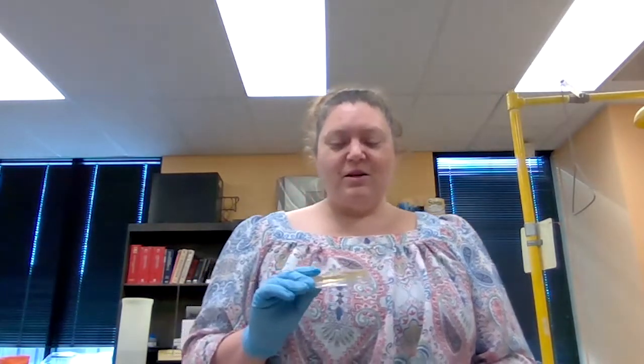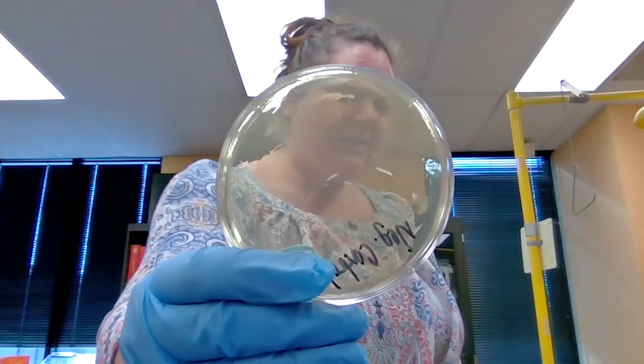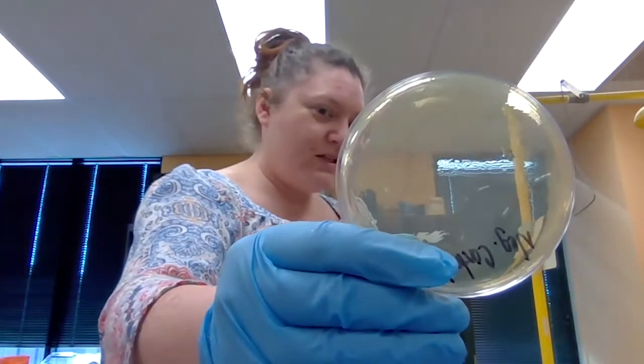Then at the end of that time period, I would take them out and see if any bacteria is growing. We are going to take a look at the Taco Bell samples that we ran. We start off with our negative control plate. If you remember, we expect nothing at all to be growing on our negative control, because if something is growing there, then there is something wrong in our experiment, and we can't really rely on the results of our Taco Bell exploration. So we take a look at the negative control, and I'm sure you can see there is nothing growing on this petri plate. No bacteria whatsoever.